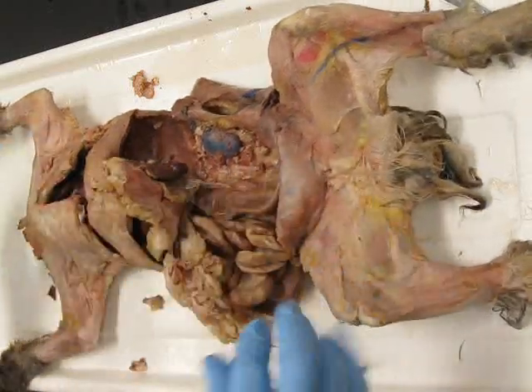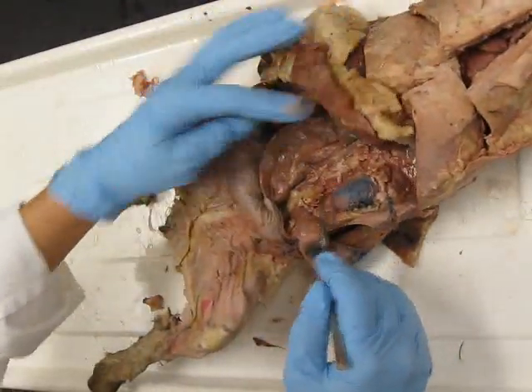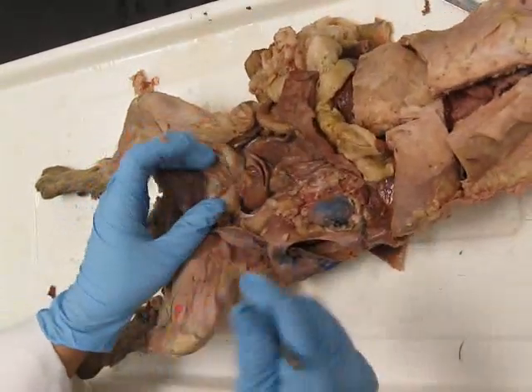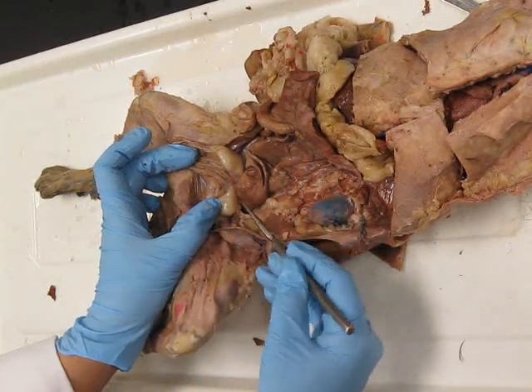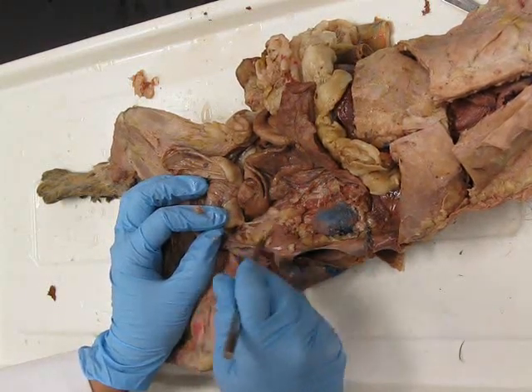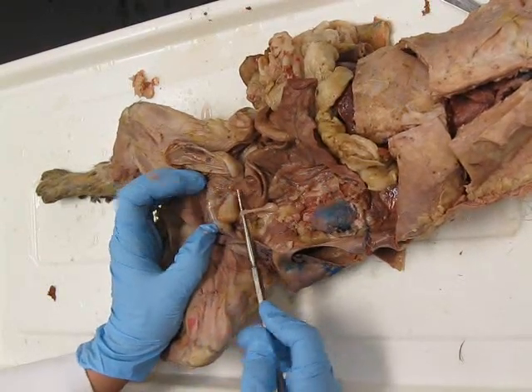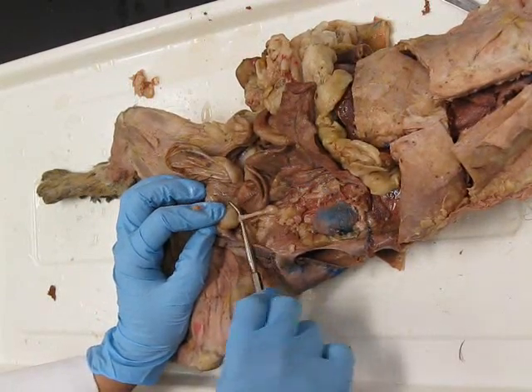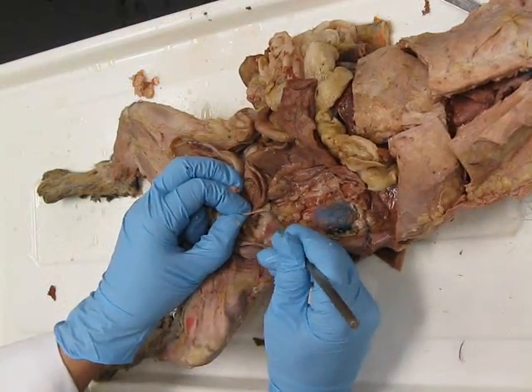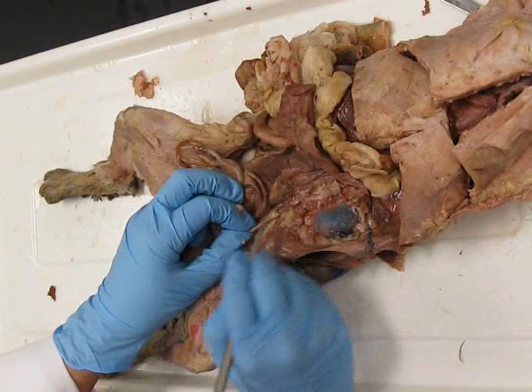And then you're going to find the ureter. Now, one of the best ways to find the ureter is to actually start at the urinary bladder rather than trying to find it in all of this fat. So what you want to do is locate your urinary bladder and down inferiorly at its bottom, there'll be a tube coming out of there. And you just go through that membrane, it's the same membrane we were removing up here, and there's that white tube. Once you have that isolated, you can just clean it by running the probe along it, and then it's going to go under a set of vessels. Don't cut those vessels off, this little fat blob, because those vessels are gonadal, so we'll be learning about those in the cardiovascular system.